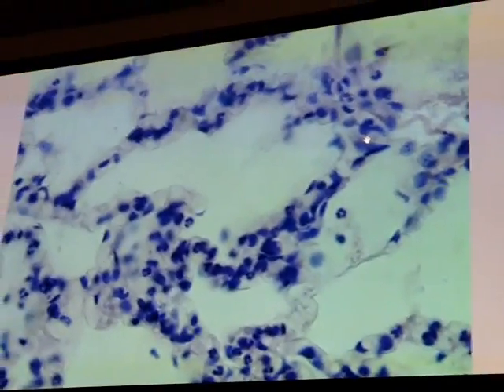The third type of cells is the macrophage of the lung, called dust cell. This cell is irregular in shape, found on the surface of the interalveolar septum or wall.